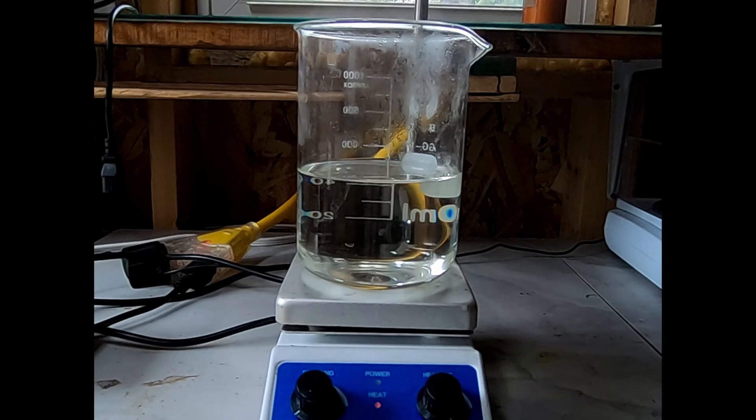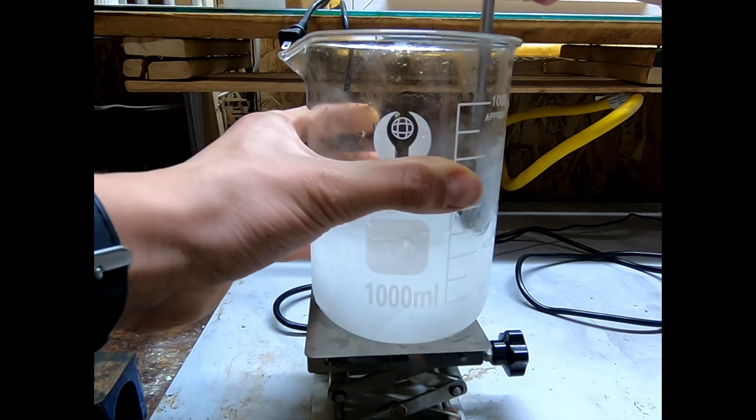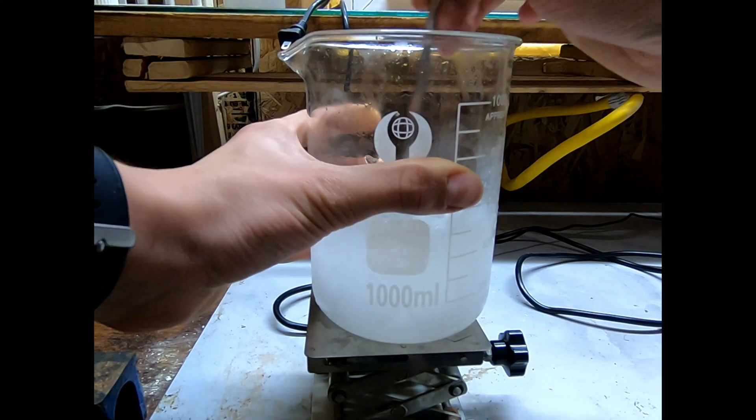Once that's done, I take it off the hot plate and place it in the fridge then the freezer overnight, which leaves me with some nice white crystals stuck in ice.